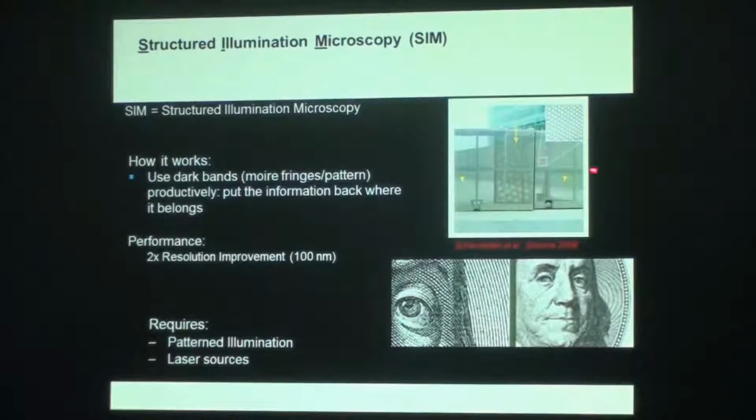Some fine mesh doors, for example, in this example, as you see, there is a clear mesh in these two different locations which you don't see with your naked eye. But when you superimpose these two patterns on top of each other in a specific little rotation, you can see the actual pattern in this mesh hidden, as you can see when you superimpose it. This is what is called Moire fringes. When you actually look at the actual pattern in an individual door, then it matches the Moire fringes.